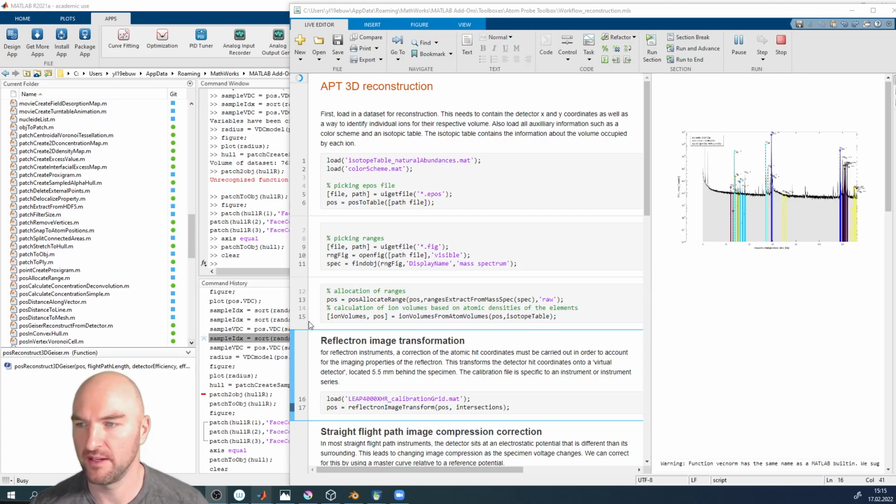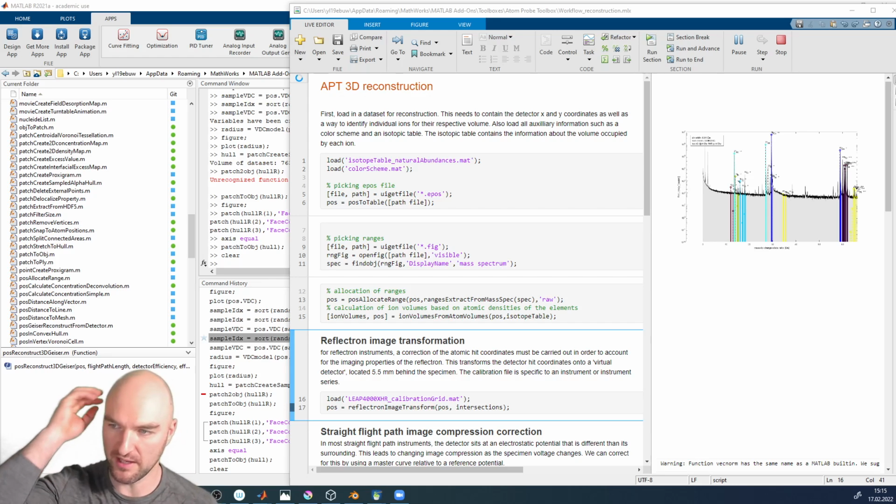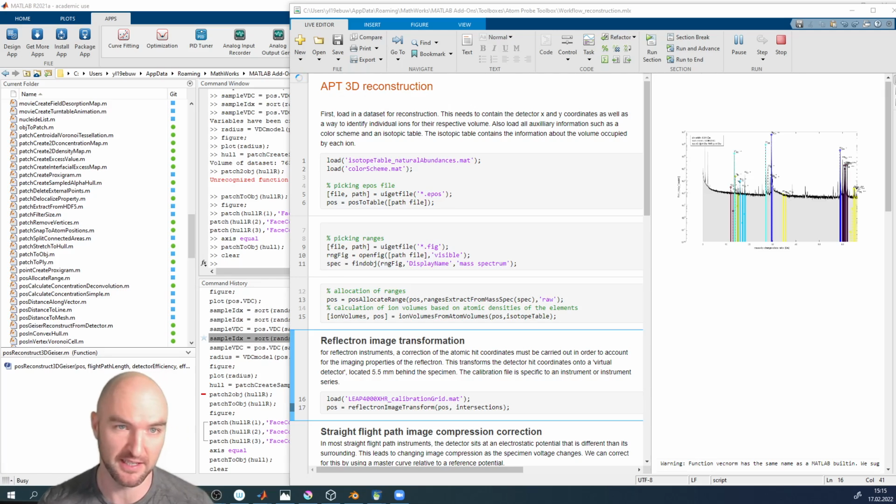So welcome to the last session for today, which is reconstruction calibration based on objects in your data. Andrew has already shown you that you can use the crystallography in the data, if there is crystallography. But more often than not, we actually have certain objects in our data that we can use for reconstruction.